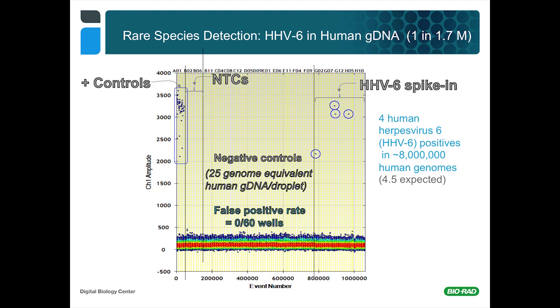Subsequently, I'll go on to actually looking at rare mutations, which is oftentimes very powerful in studying cancer etiology and treatment, and in this case we use a couple of assays directed simultaneously either against the wild type allele or the mutant allele, and I'll show you that in a moment.